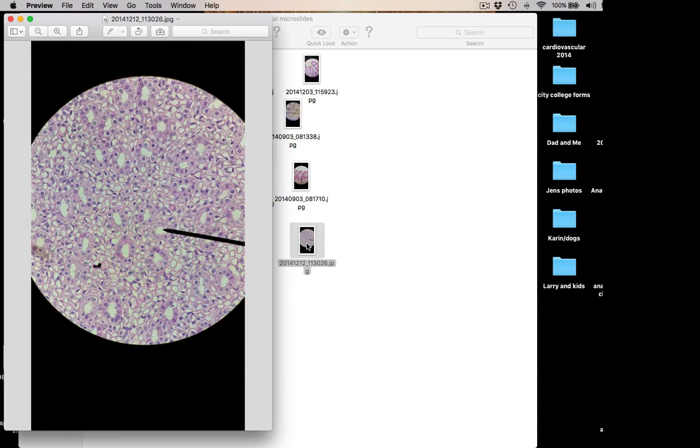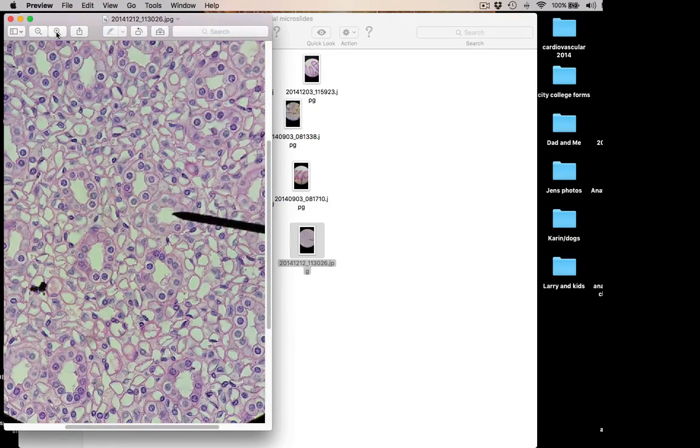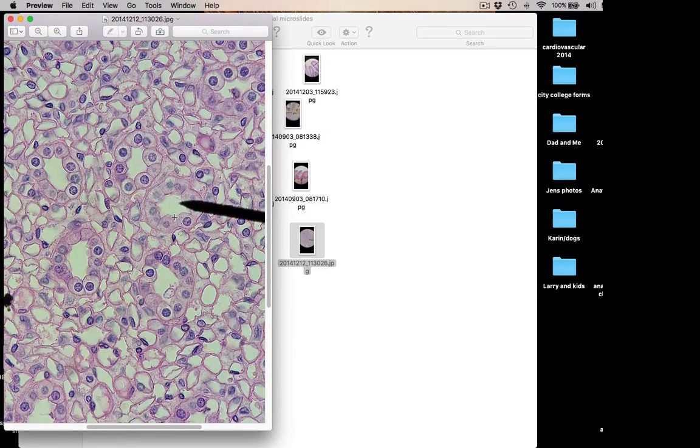And our last one. Oh, an easy weasy one. Pointer in the lumen. Here's the basement membrane. Nice round nuclei. This is simple cuboidal.